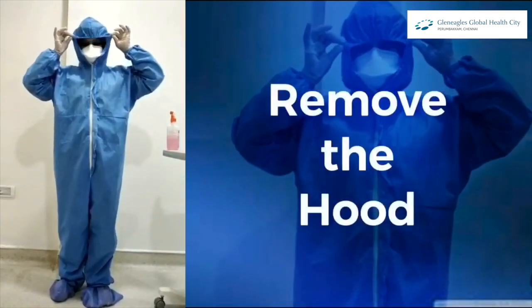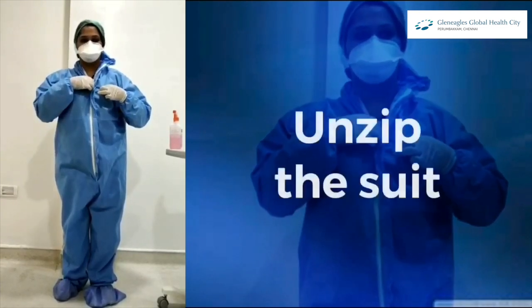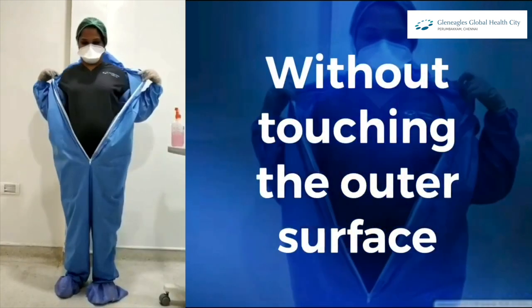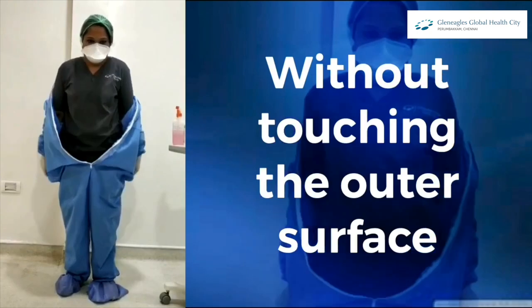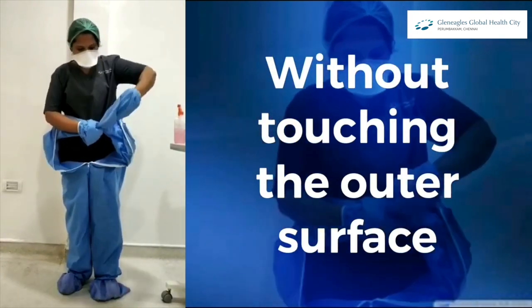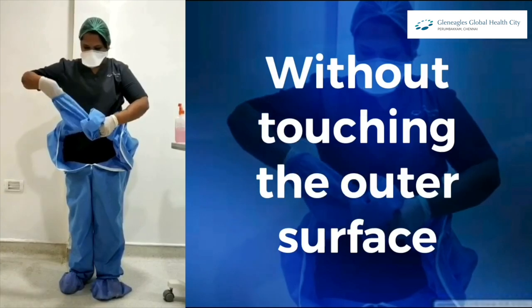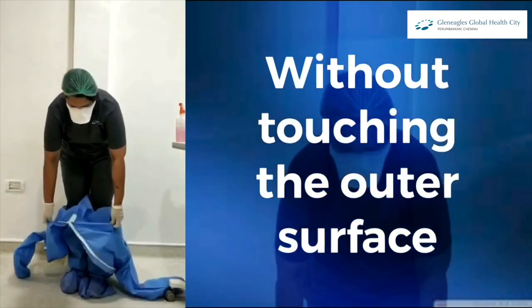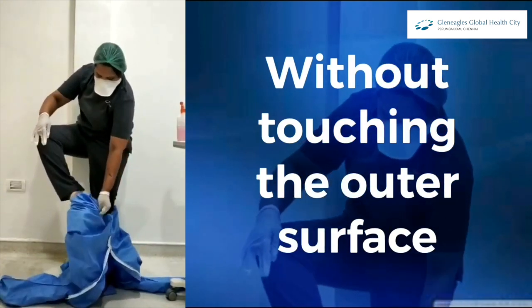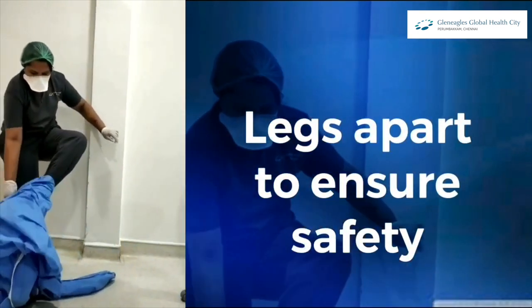Now remove the COVID suit by first removing your hood and unzipping the suit. The outer surface should never touch your body. Take your legs apart to make sure the outer surface does not touch your body.